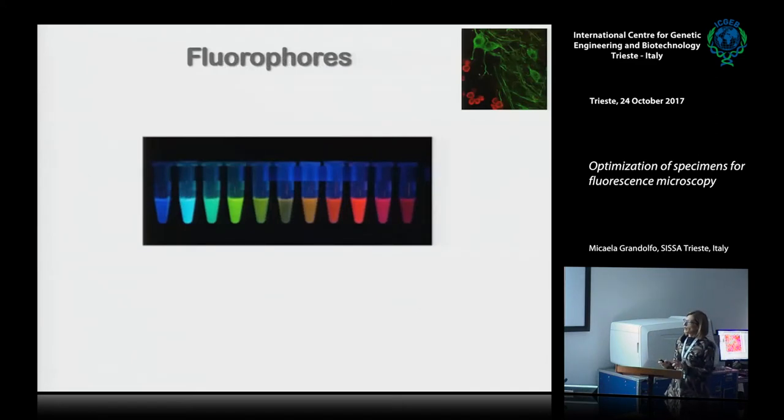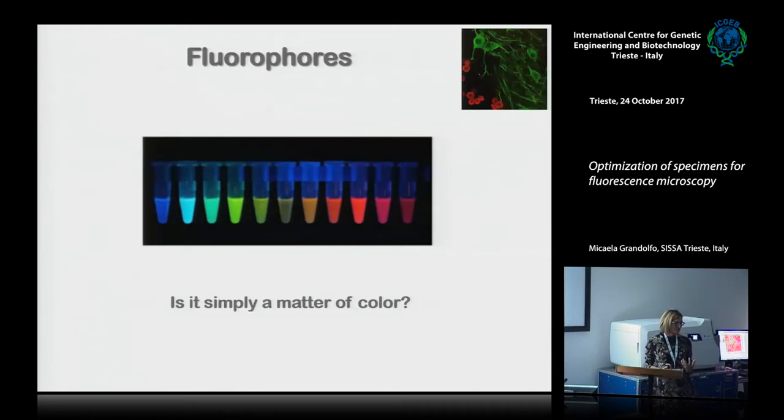Okay, and now let's move to the fluorophore. You know a lot about the fluorophore because we had the talk of Gabriele a few hours ago, but I would like to underline some characteristics of the fluorophore, just to give you an idea of what you have to take into account to choose the right one for your purpose. Okay, how can we choose the right fluorophore for our purpose? Is it simply a matter of color?